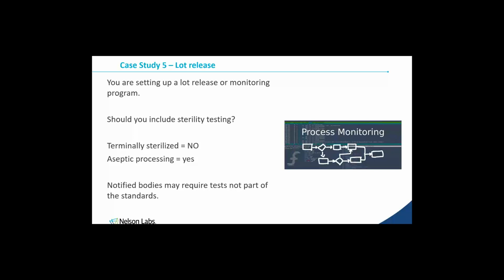Well, what happens when I have that positive test to sterility result? I don't have guidance from the ISO standard because I'm not following the ISO standard, for example, on verification dosing or half cycles. Instead, I'm testing terminally sterilized product.